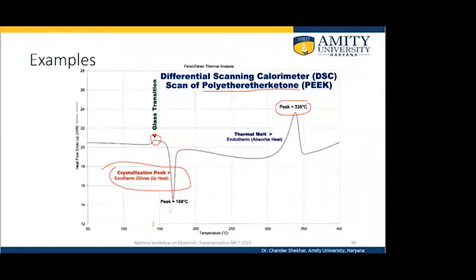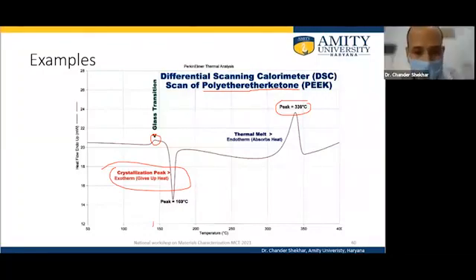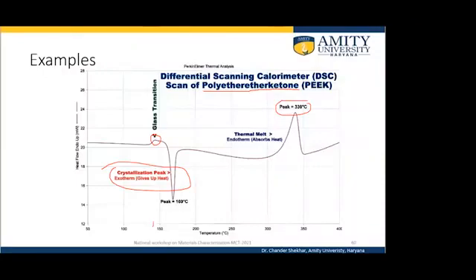Okay, there's one from Rohit Yadav. He says, if our sample is inert in the temperature range, then can we measure the heat capacity?